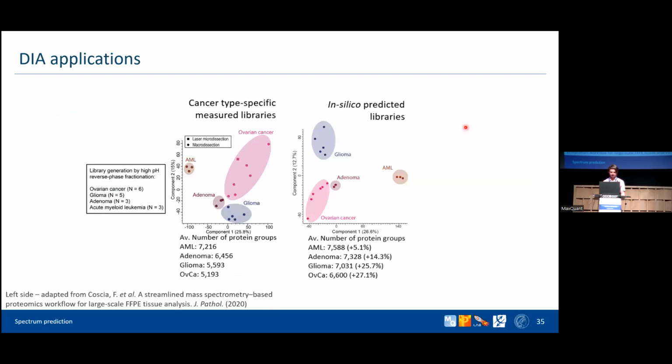But then we move to DIA, and as I've already told you, the increased sensitivity from spectral libraries is particularly important.